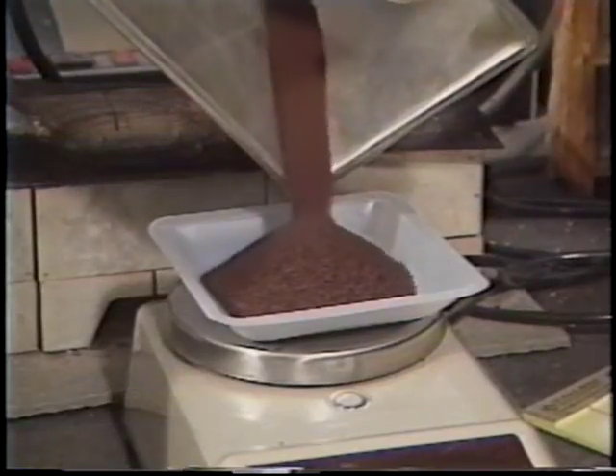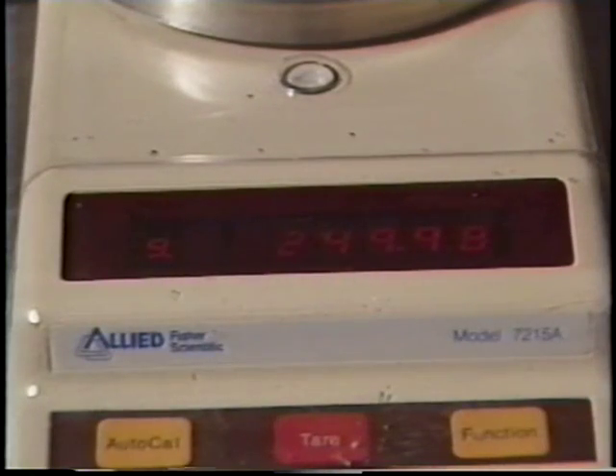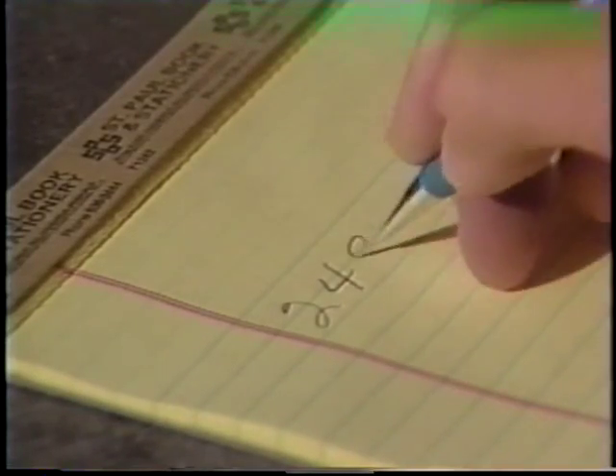It is important to weigh this sample accurately and to record this initial weight to two decimal places.